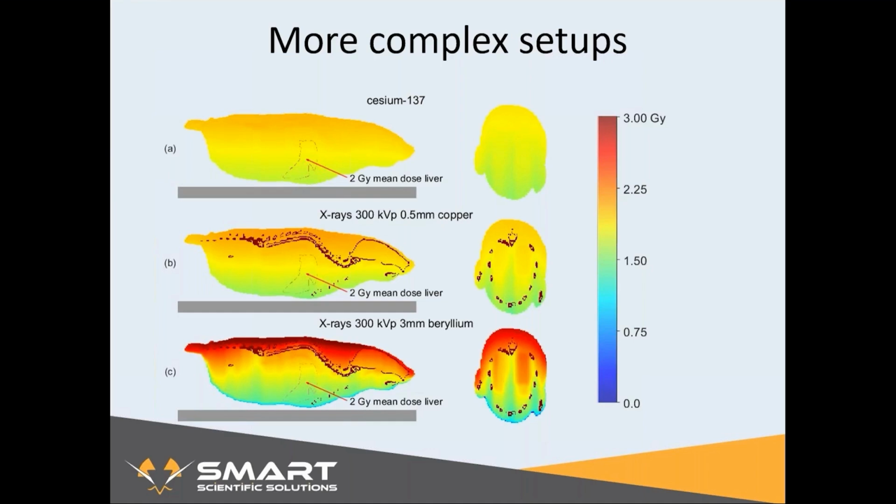And for the middle one, that's a realistic spectrum to be used. I think you can't really approximate that anymore with a point. The bottom one becomes completely impossible, but I would never advise to use a spectrum that does not have an external filter and only the inherent filtration.